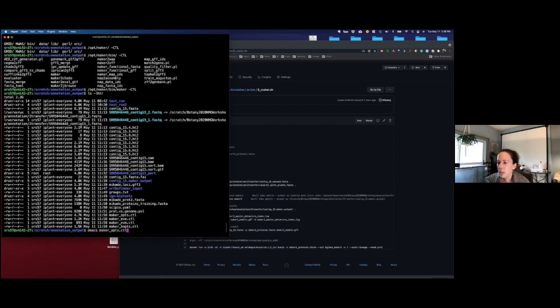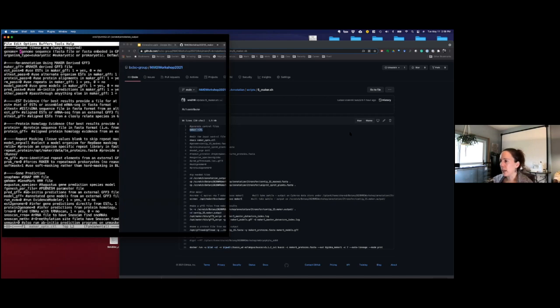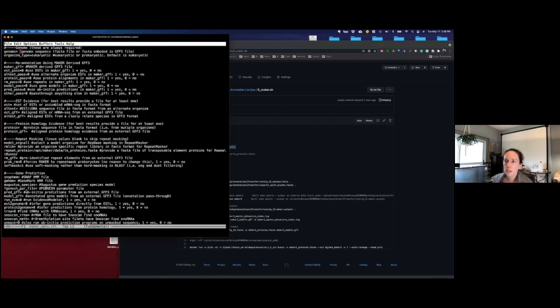So I'm going to use Emacs and we can take a quick look at that. You can see it's just a text file, but this is the input file that directs Maker to everything. So you would put your masked genome here. I think I have this information in the script. So these are the things you'd want to edit in our example. You'd add the masked genome, and then you can add the curated proteins under protein. Down here, you can see it takes all sorts of information. If you had some EST sequences, you can throw those in. If you had some aligned sequences in GFF format, you can put those in. It'll even do the repeat masking for you, but I usually do this, or I should say Adrian usually does this, using the pipeline we already discussed and not running it through Maker.